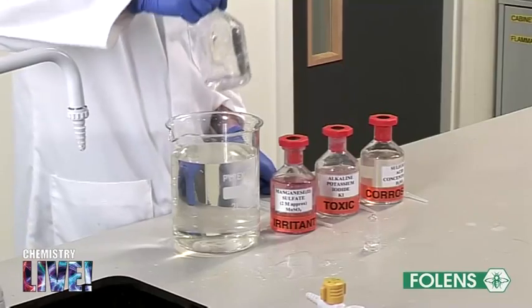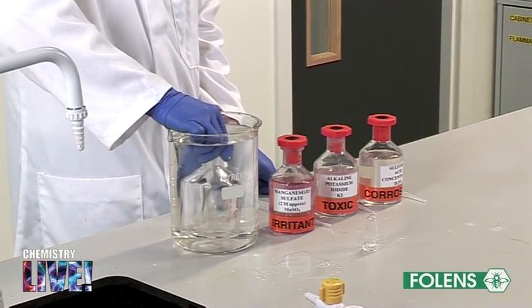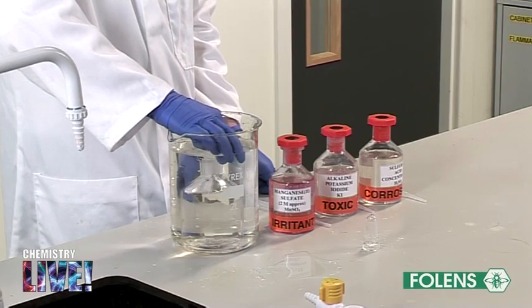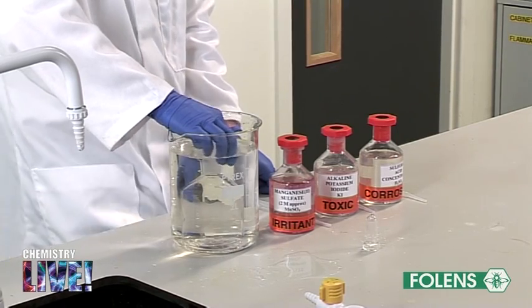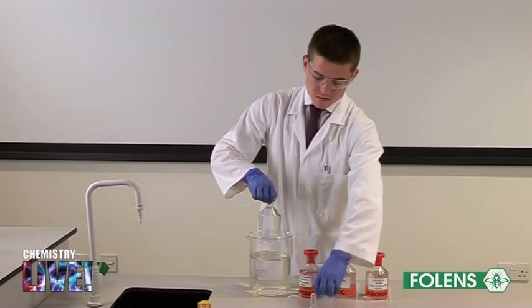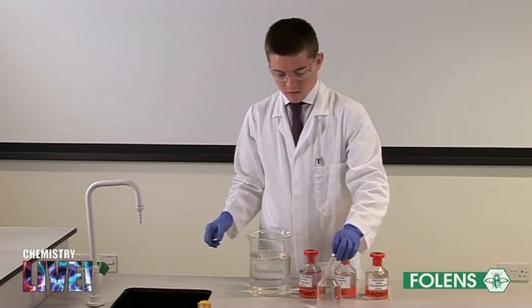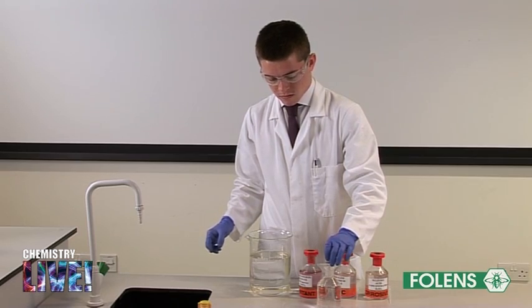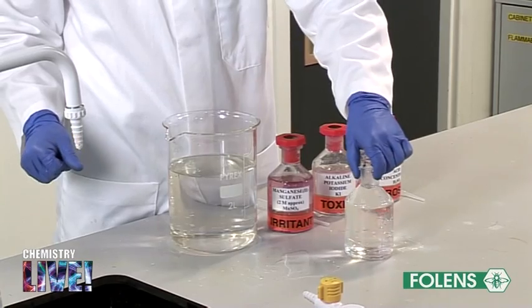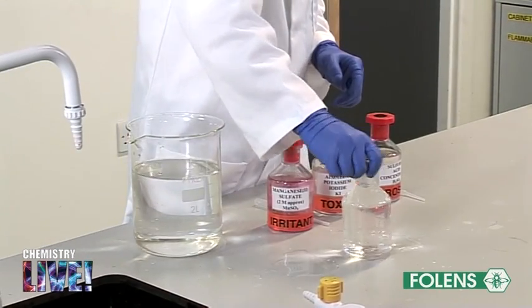Submerge the bottle completely in the water to be analyzed and fill the bottle right to the top. The bottle is then stoppered. When collecting the water it is important that no air is present in the bottle, as this would raise the oxygen level and give an inaccurate result. Therefore the bottle must be completely filled to the top.